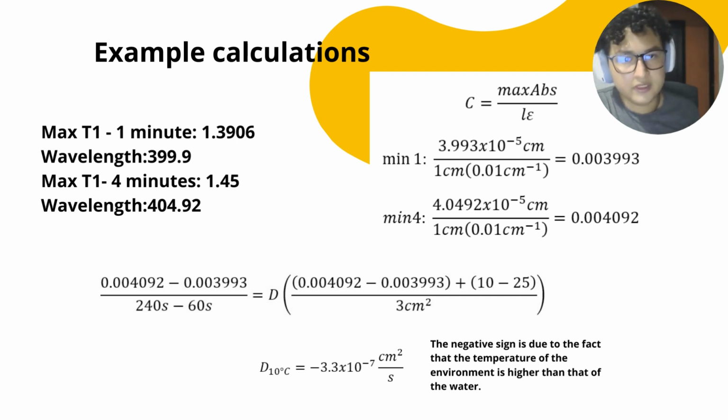Okay, we have the wavelength. So we will use this information to calculate the concentrations.